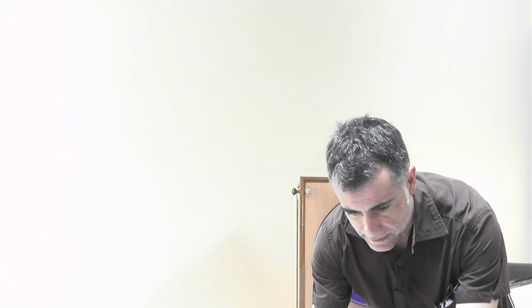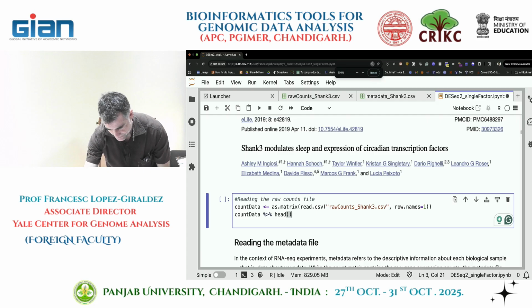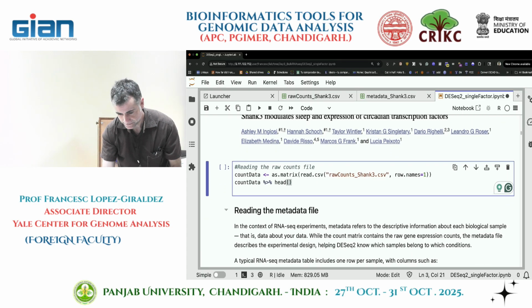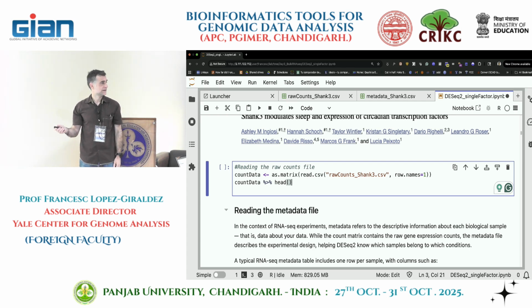I guess it goes to sleep. So if I want to, oh, by the way, is it too small, or not in the back? Should I increase this? Okay. What about now? More, less? More? Okay. Is this the same as what it was before?